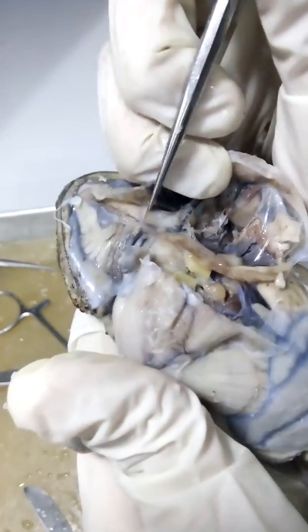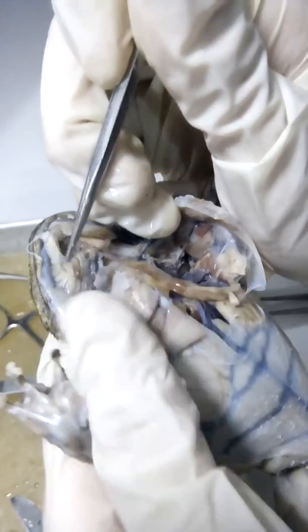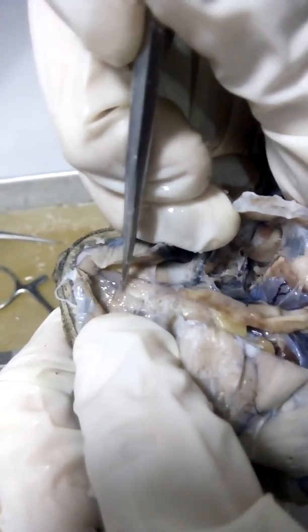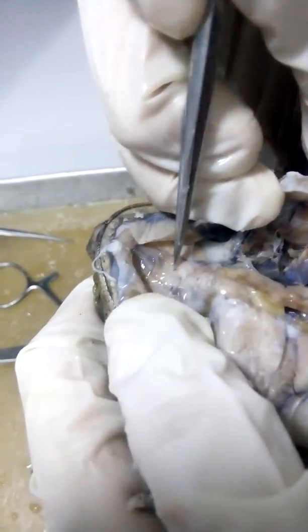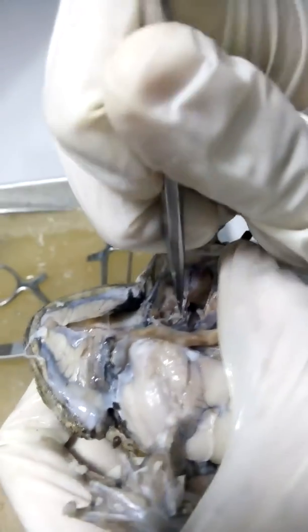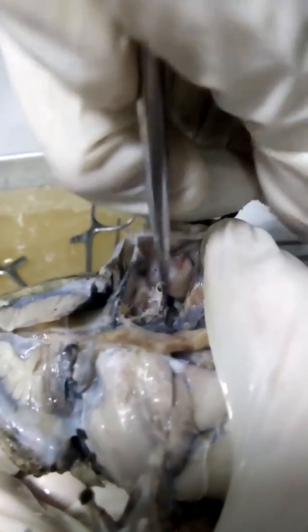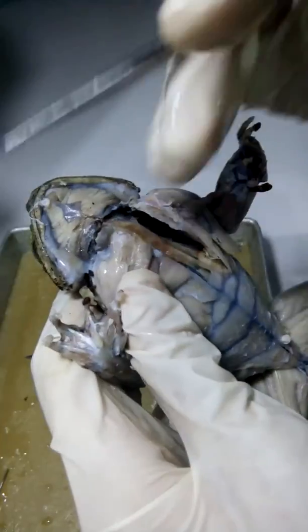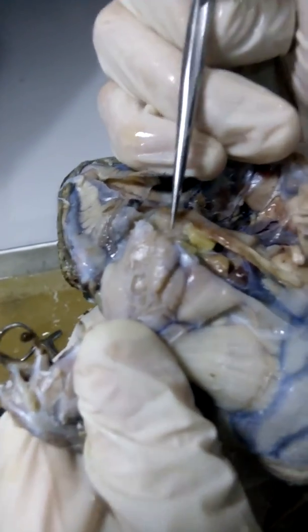So again, this is your sternohyoid. This is your hyoglossus. Genioglossus. Okay. This would be your omohyoid, and this petrohyoid. Okay, so I think wala naman tayo na miss. This is your hyoglossus. So your muscle of your throat.